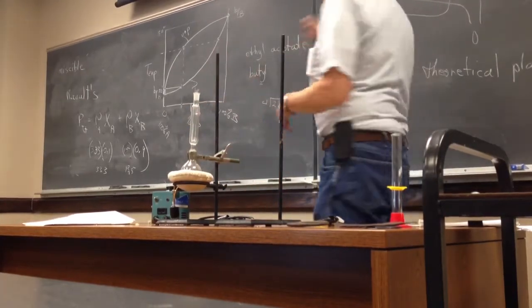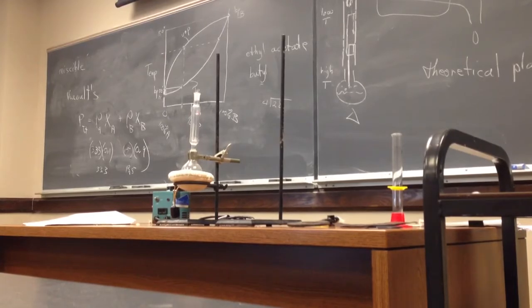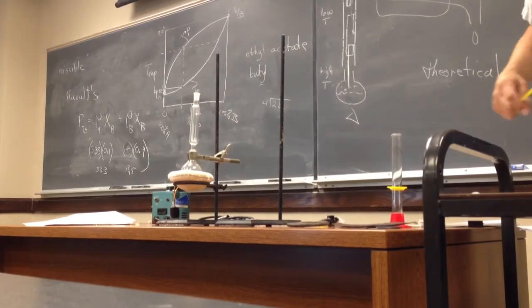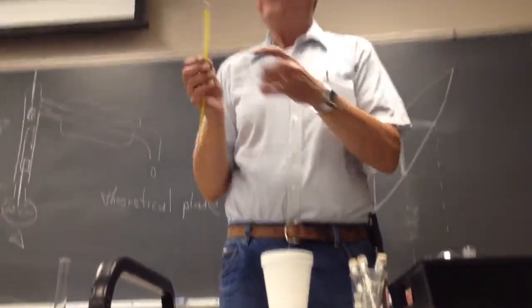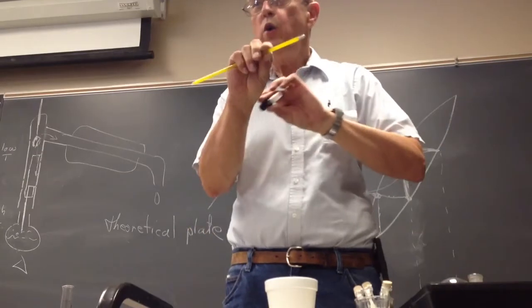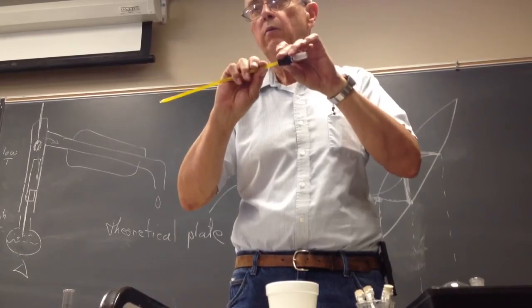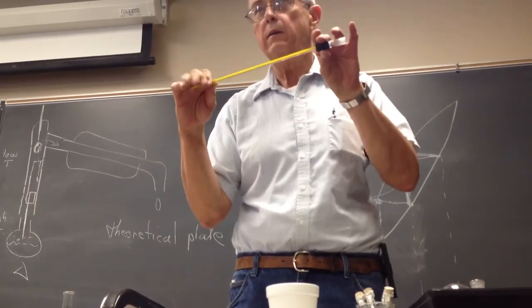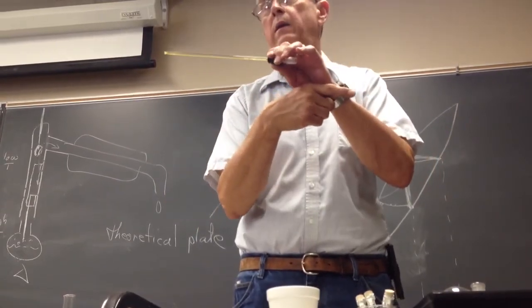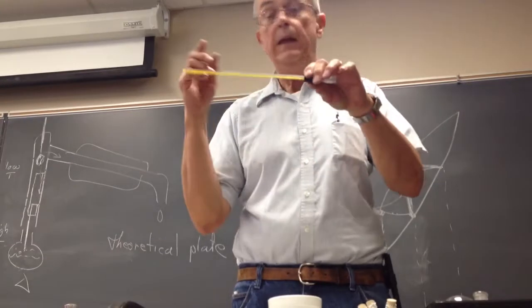Now I need to measure the temperature of the thing, so I've got a little thermometer adapter. It's got a rubber collar on it. I've got to stick a thermometer through here. The thermometer needs to go through that rubber stopper. Little tiny bit of stopcock grease, essentially Vaseline. Little teeny tiny bit. Don't try to push it straight in. Twist it. Get your hand close to it when you do that. Don't push way out here. It's easy to break it. And if you break it, the likelihood is this piece will go right into your hand. And then we'll go right down to campus safety, and then you will go right over to the hospital. And that's what happened last year.